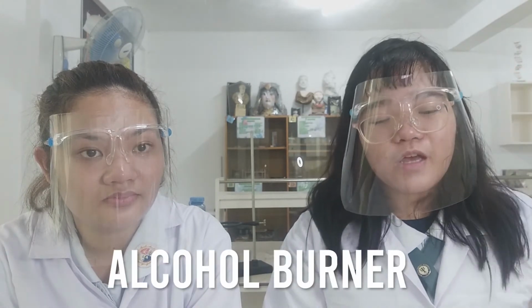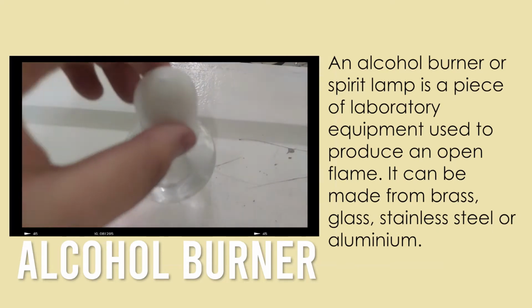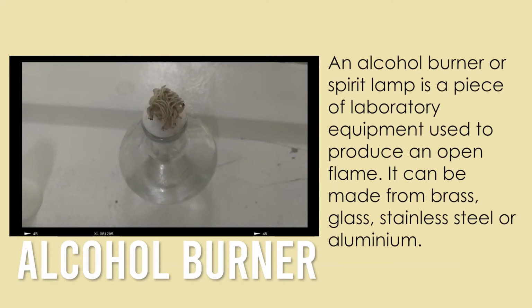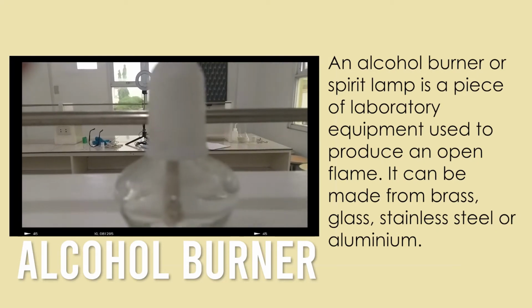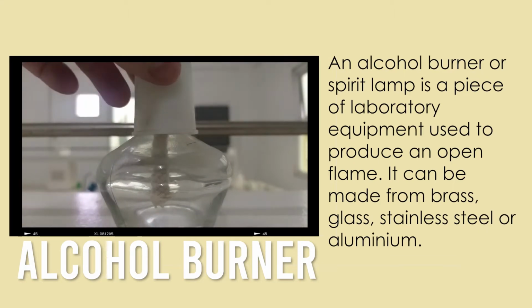Meanwhile, there are some instances that you don't need a Bunsen burner in heating an object. There is what you call an alcohol lamp. An alcohol lamp is basically an open flame that is used for heating, sterilization, and combustion inside the laboratory. It is usually paired with either an iron stand or another shape of iron stand.